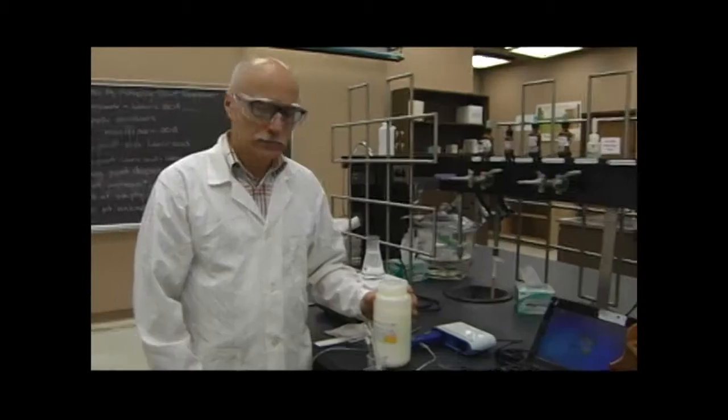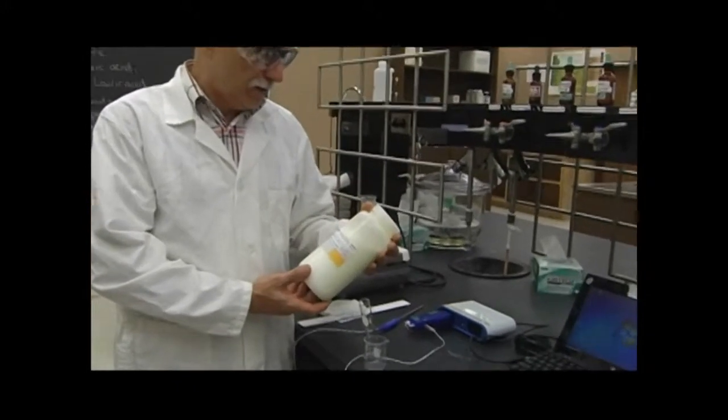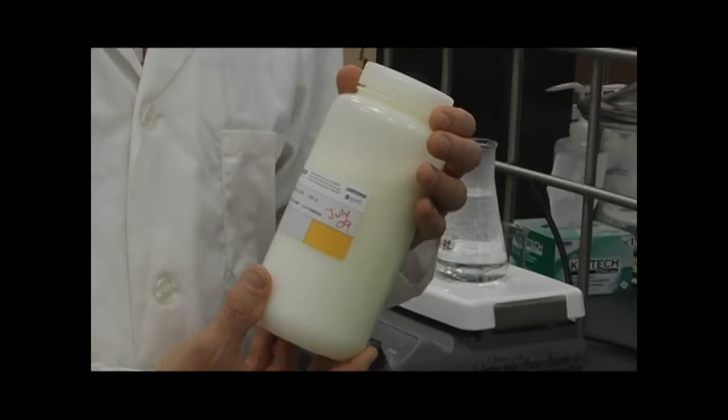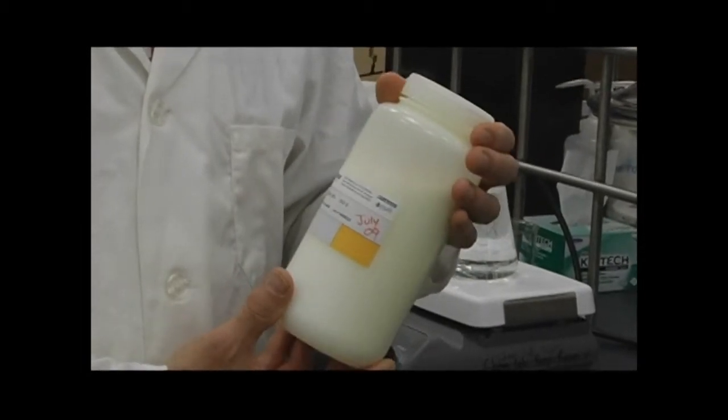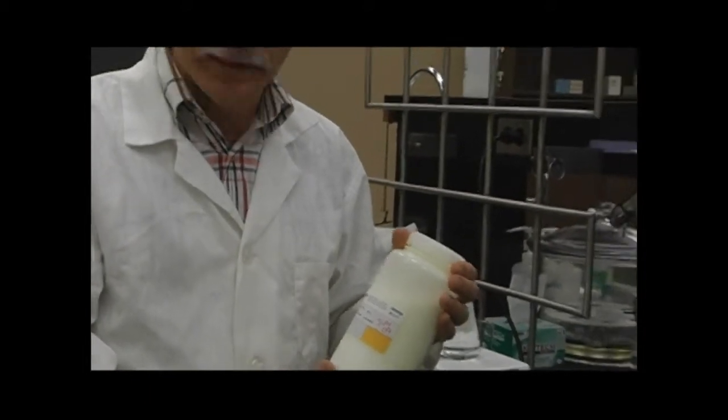So this will be the lauric acid, or the dodecanoic acid. It'll be located on the side benches, as most specialized chemicals for each lab are located.